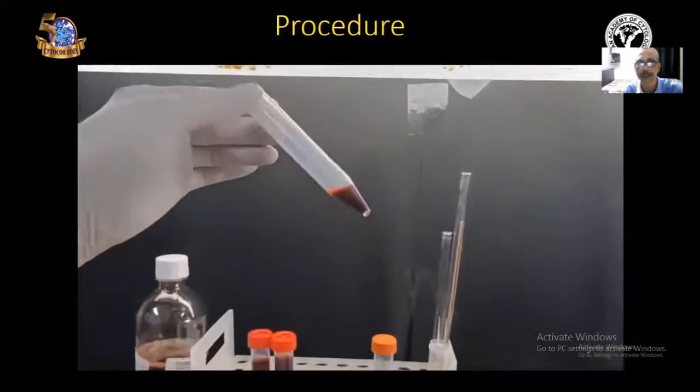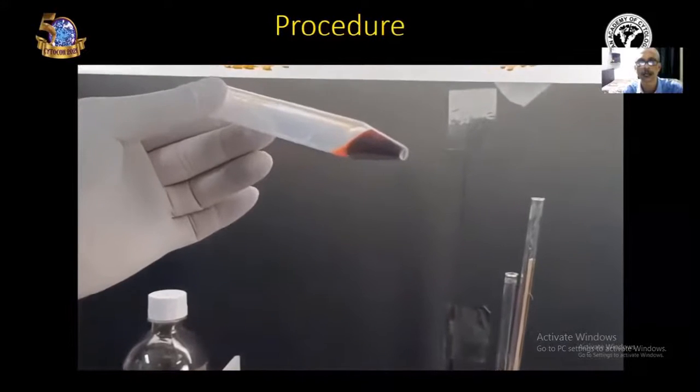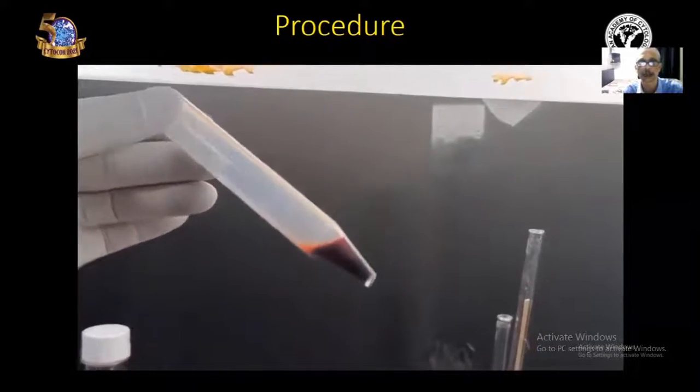At the end of five minutes, you can see a clot is formed at the bottom.